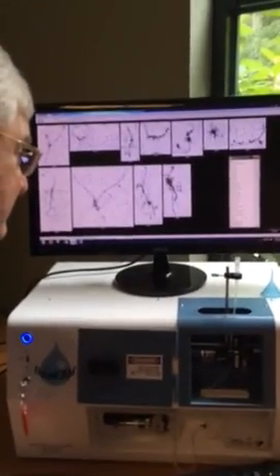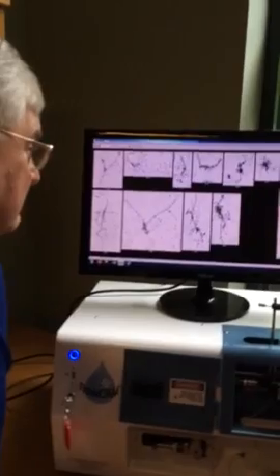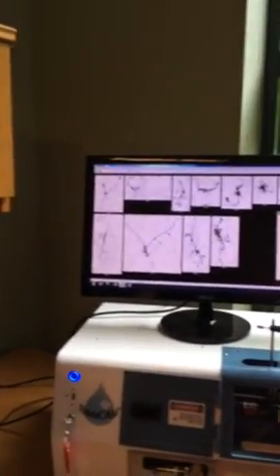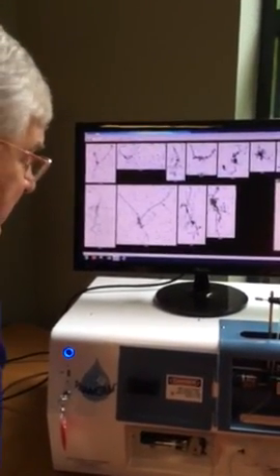Could any of these be inert, or like detritus or compounds or anything like that? Yeah, I mean, that's what I wonder. Could be a lot of compounds or just inert material that's not really even biologic. But the question is, how do we get in there?